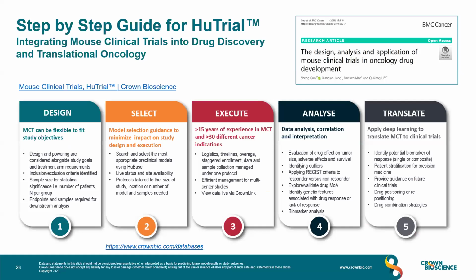So our step-by-step guide on how to design and execute the mouse clinical trial has recommendations from multidisciplinary teams that support these trials in-house. So the bioinformatics team, for example, can advise upfront on the best practice and requirements based on the study design for the number of mice, arms, and advise on statistical power.